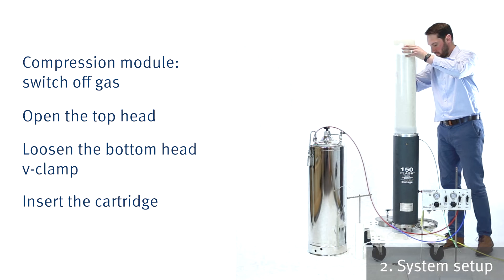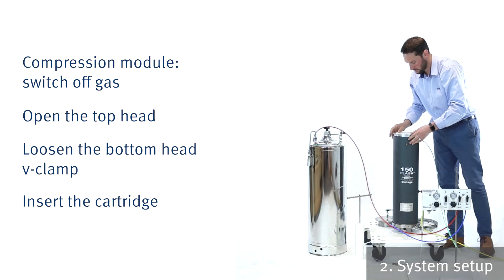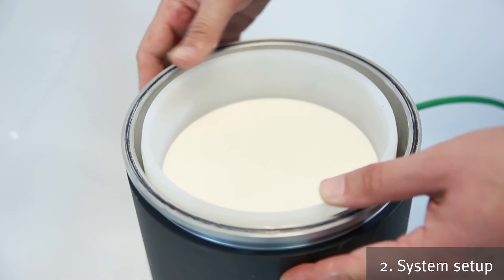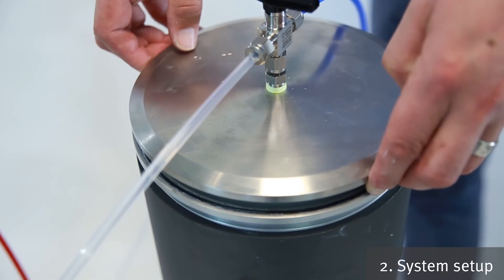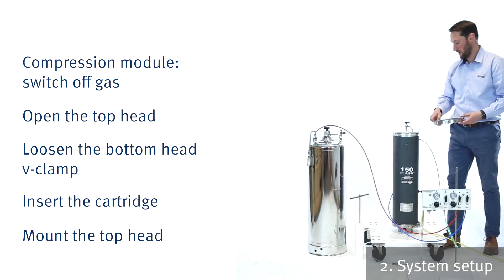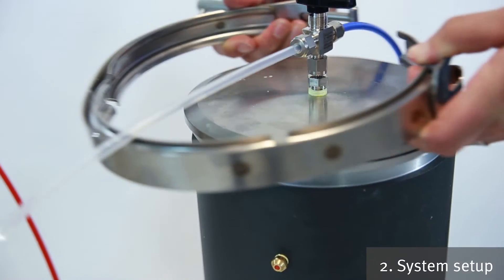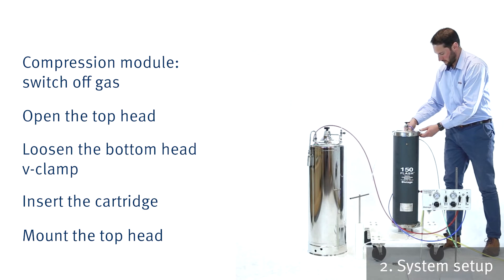Dropped in from above, making sure that it's lined up over the bottom head. Like so. Put the top head back on. And the V-band clamp goes back on. Ready to go.